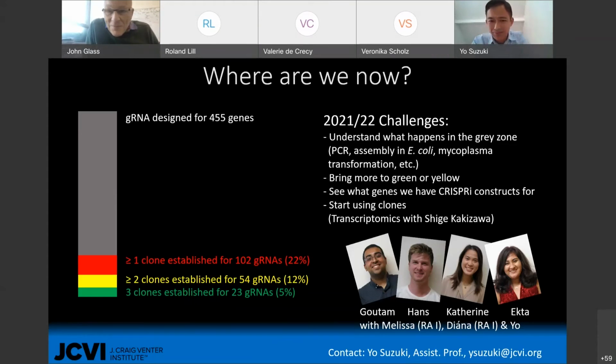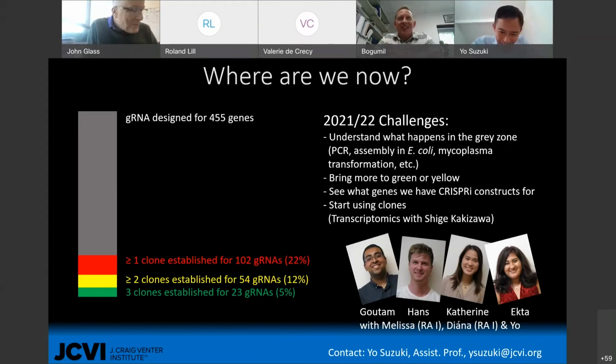Hello, Yo. That's a great job, like always. There were previous talks about mutations. If you would propagate those things induced, or even if they are not induced, do you see that they're getting mutated, those cassettes that you insert into mycoplasma? Would they lose the function quickly if you continue propagating them?